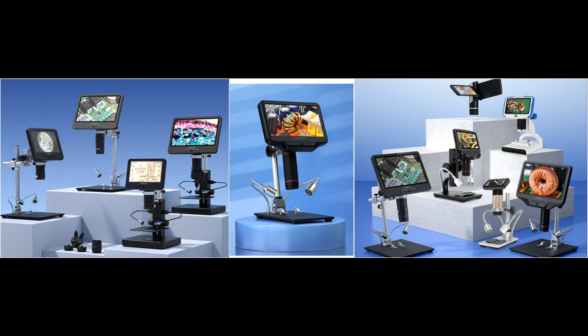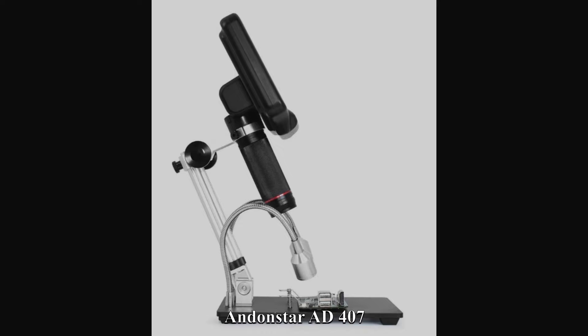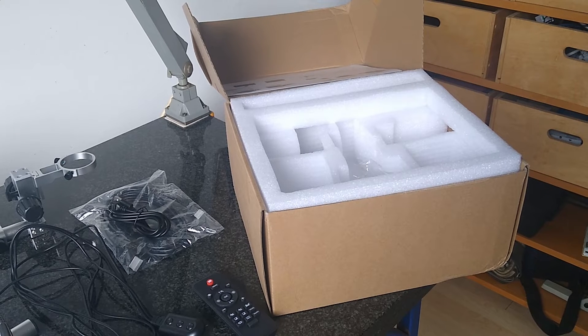It is the larger and, with a price tag of approximately €350, also considerably more expensive brother of the well-known Andonstar AD407, which can be purchased for approximately €200. In this review let's see if that extra €150 is money well spent.